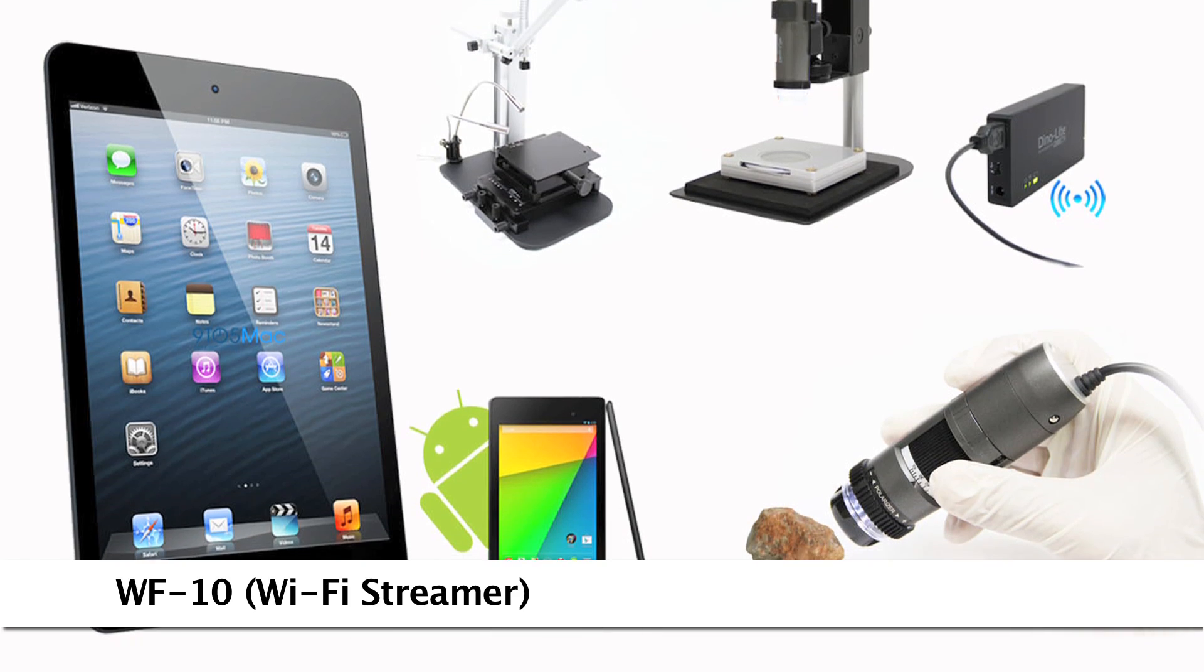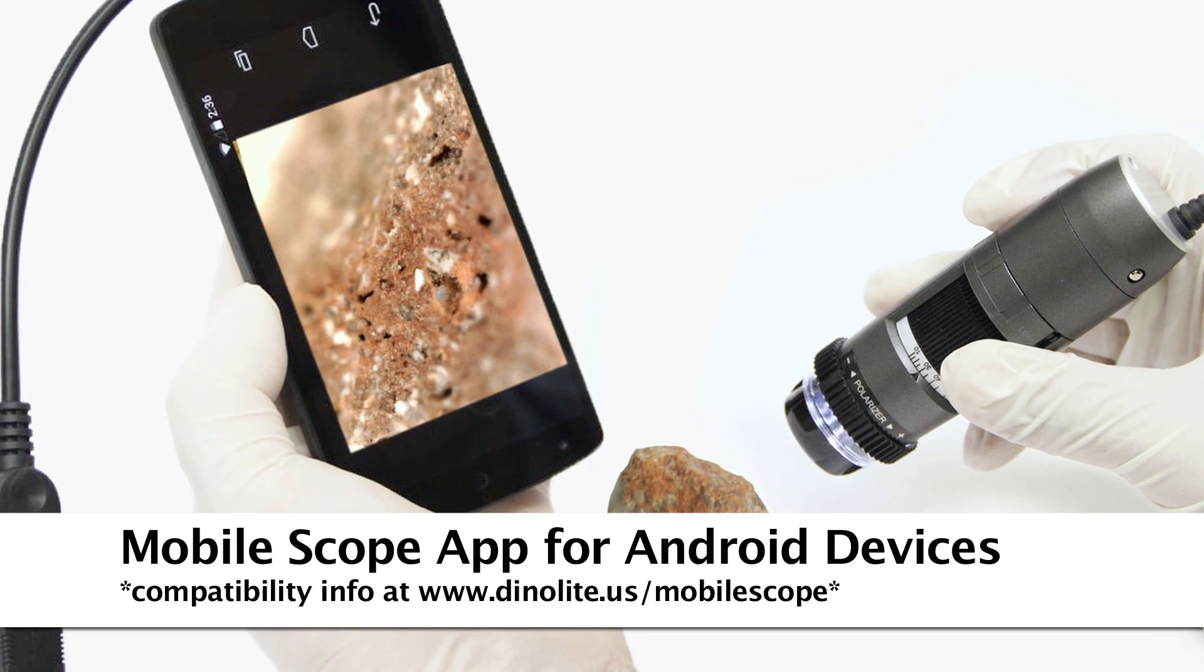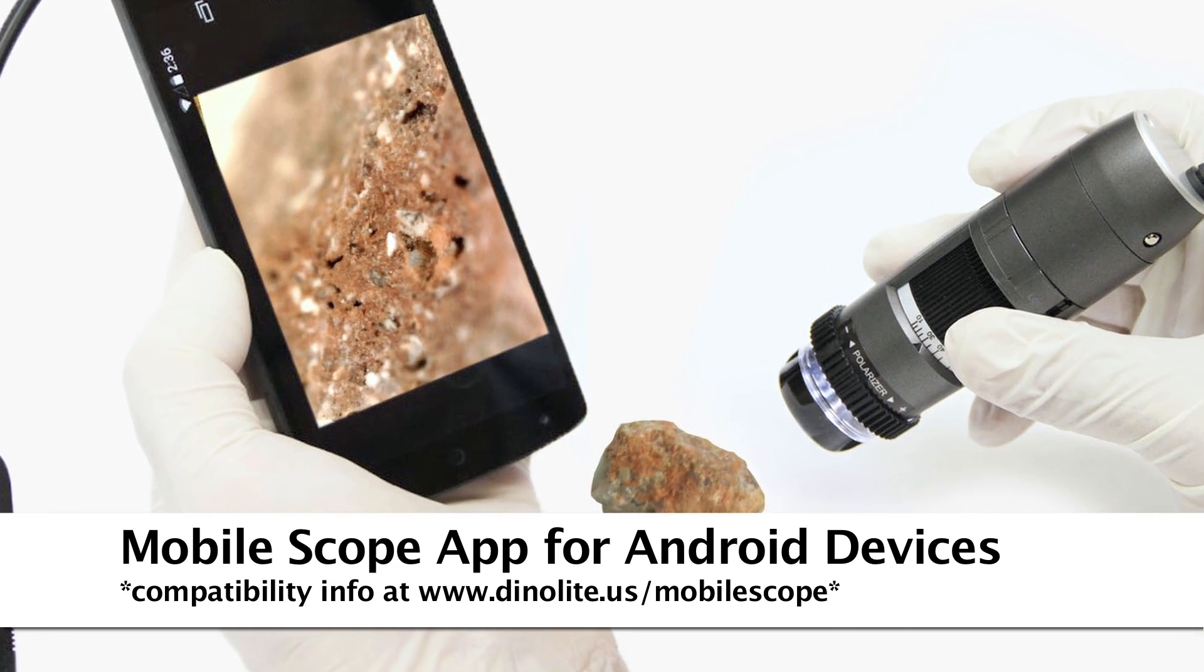There are options for mobile viewing including a Wi-Fi adapter and a direct connect option to compatible Android devices.